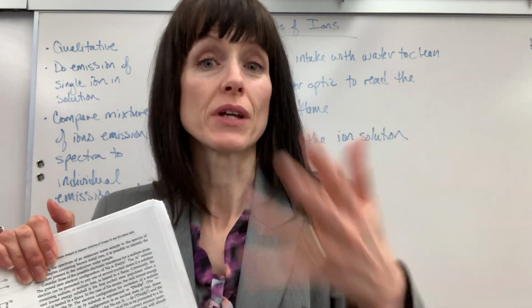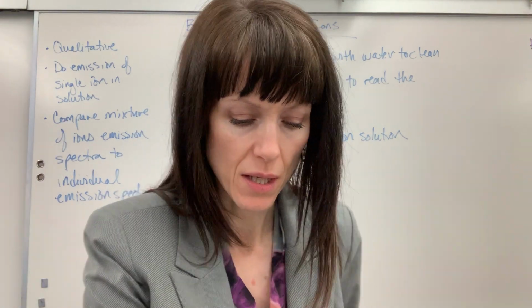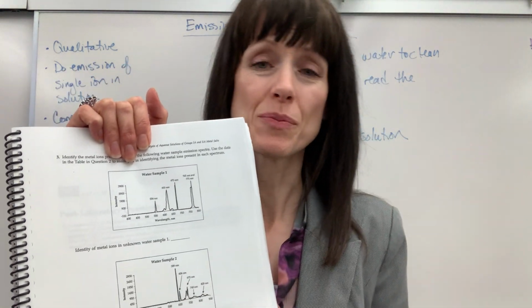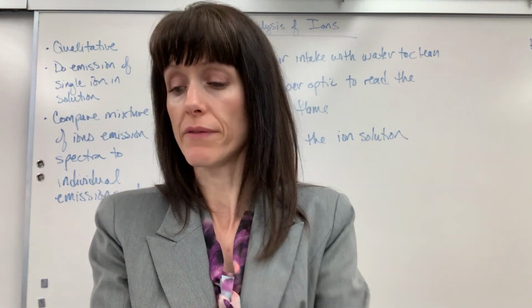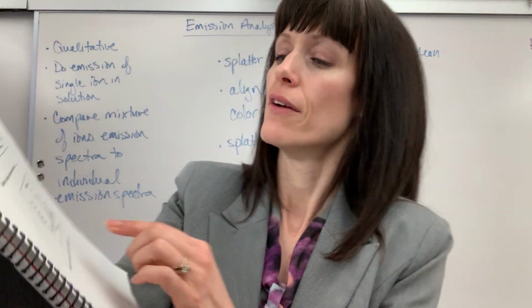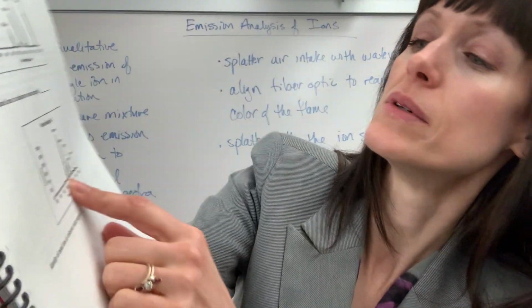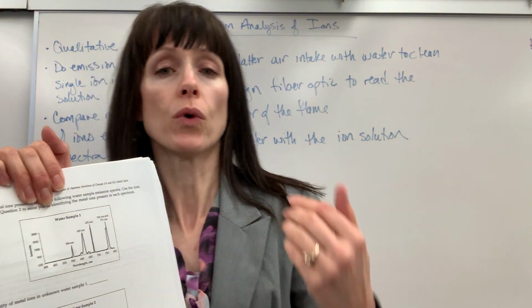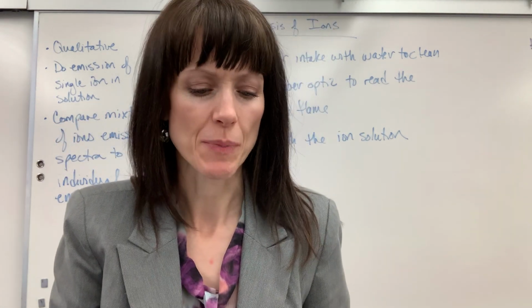Then your professor will give you a mixture. And so you'll do the mixture, and that's when you see all of these wavelengths in a mixture of a spectra. And then it's pretty cool. All you do is you line up the individual spectra you have, and you look at this and you go, oh, in fact, look at this one. In the second sample, there it is, it says 589. Looking at that, I go, oh, it matches. We must have sodium in that sample. And that's how you do emission spectra.